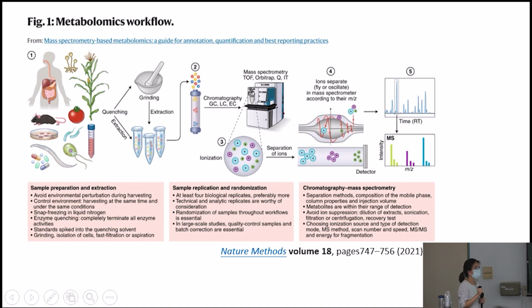In other words, if you want to get reproducible data that reflects specific conditions, you probably need to focus on sample preparation more carefully.